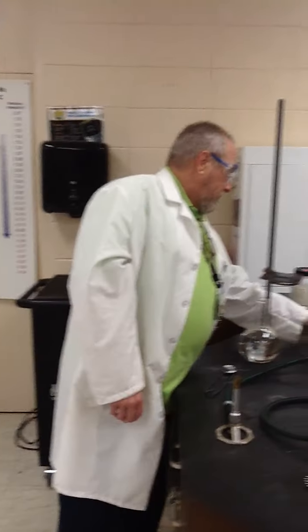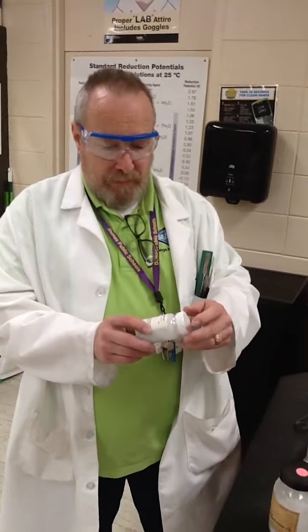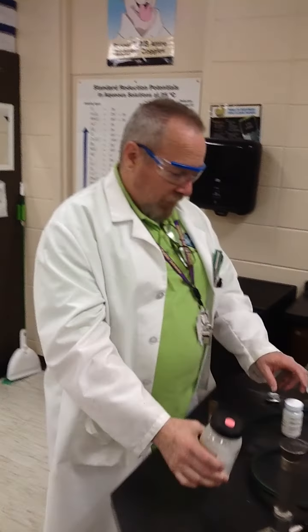One of the best things to use, and something that's been used for centuries, is marble chips. Limestone chips, also known as calcium carbonate, also known as boiling stones. All these are small chips of marble. Here's an old one, marble chips.